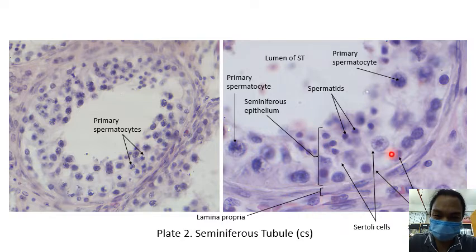This is where meiosis produces new sperm cells or spermatozoa. So there are several cells here, and the biggest among them with these nuclei that are non-dividing and with very prominent nucleoli. Here's one in the background. These are the Sertoli cells. The Sertoli cells actually do not undergo meiosis, but they are here.